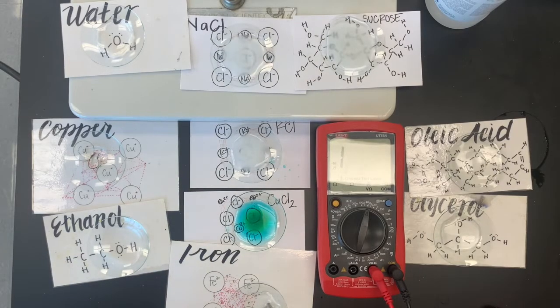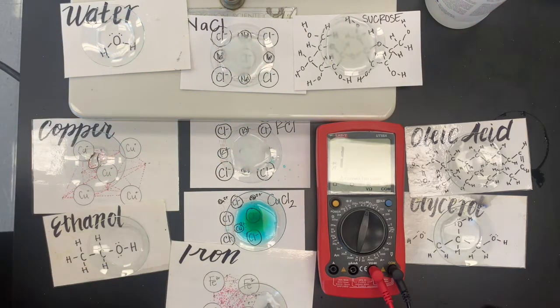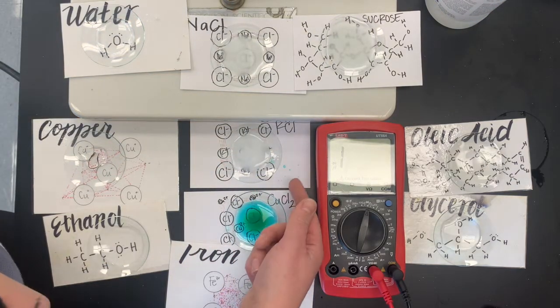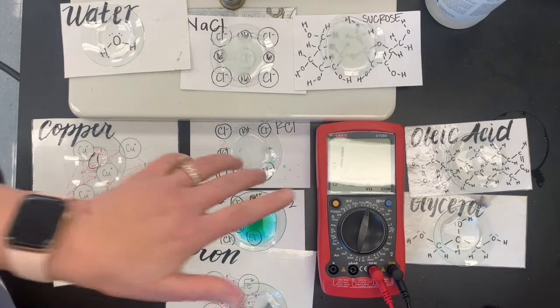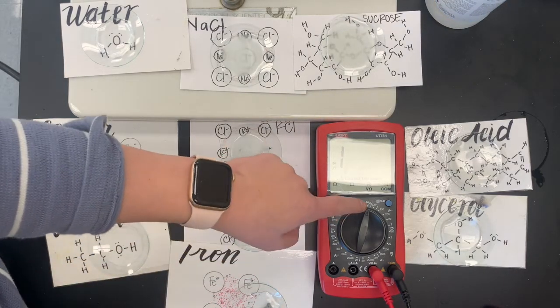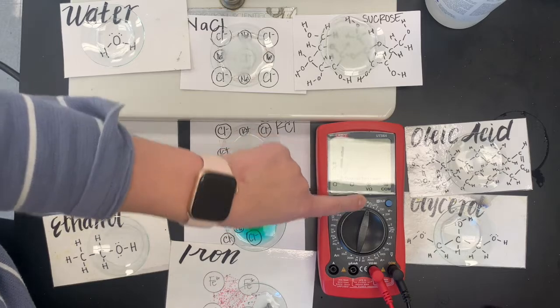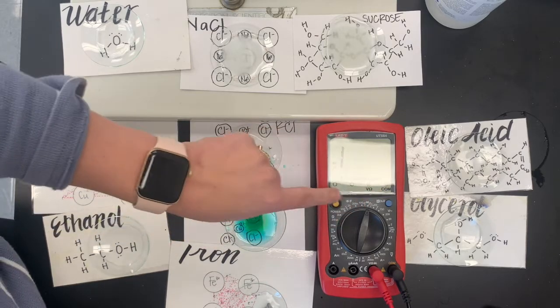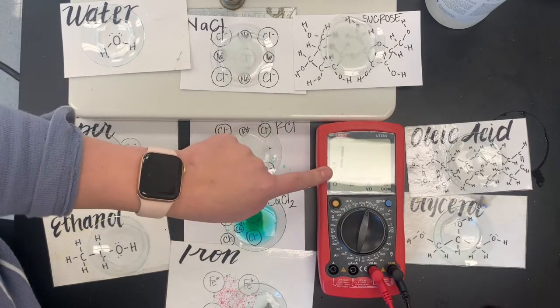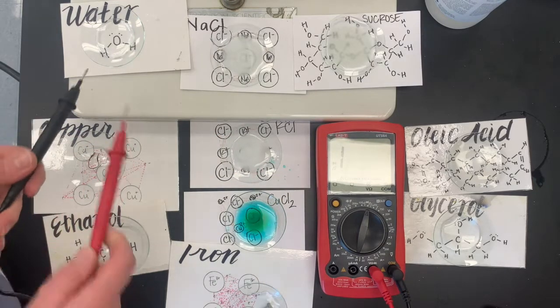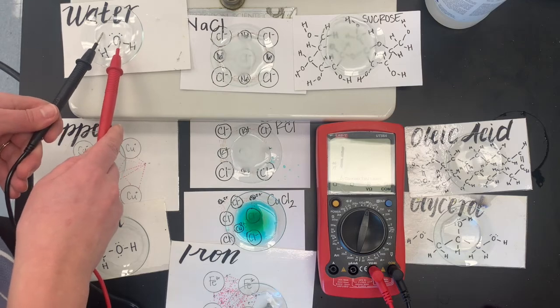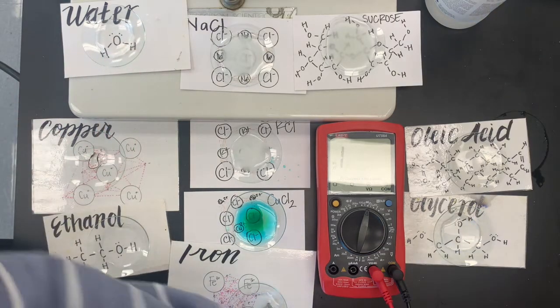We have moved on to our final test. I reset up my potassium chloride. Don't worry. The copper chloride is all in the background there. So something that's interesting is because there's a certain threshold to meet to get this to go off. I do want to actually pay attention to the numbers to see if we're getting some conductivity going on. So let's just see. I've cleaned off my leads pretty well. So water, nothing.